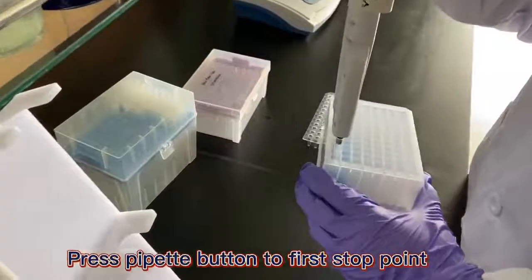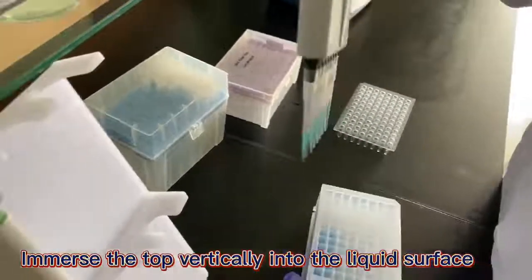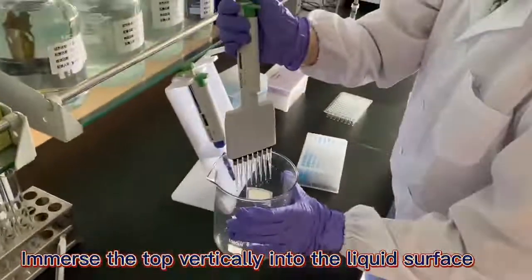Liquid suction: press the pipette button to the first stop point, then immerse the top vertically into the liquid surface.